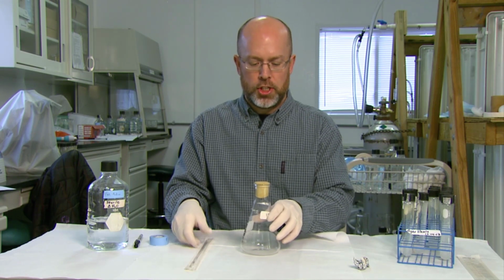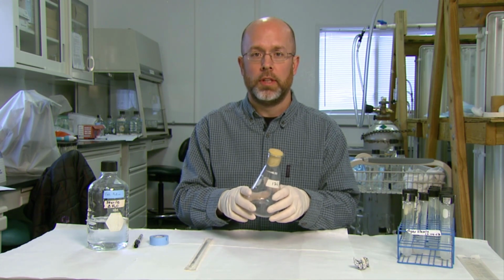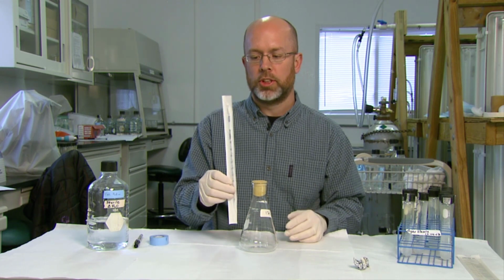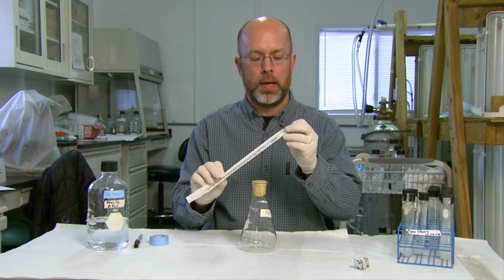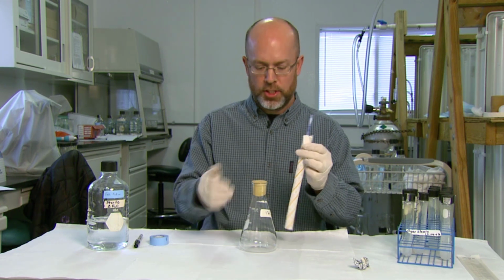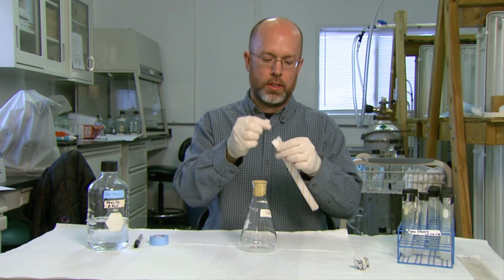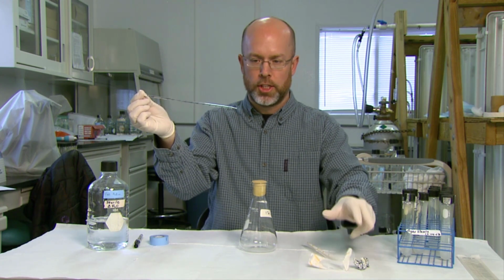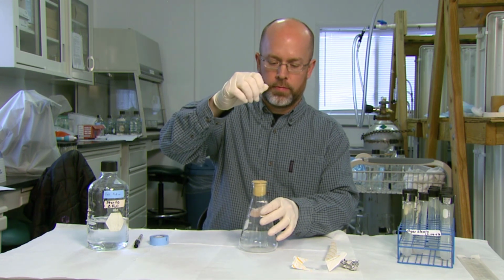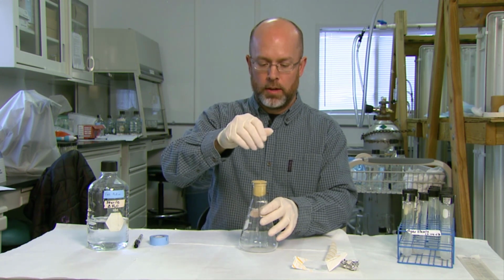Then, in addition to the media, which we're going to add, obviously algae need light to grow, nutrients to grow, and they also need carbon dioxide to grow. So we need to have some way to add air to this system. And that's what this 1 milliliter pipette is for. We've just turned it basically into a bubbling tube. So again, anything that's going to be in contact with the algae, in other words, anything that's beyond the stopper, you don't want to touch. So you take this out, not touching it to anything, and inserting it into the foam stopper. In this case, we already have a hole in the top of the stopper, which aids in getting the pipette through the hole.